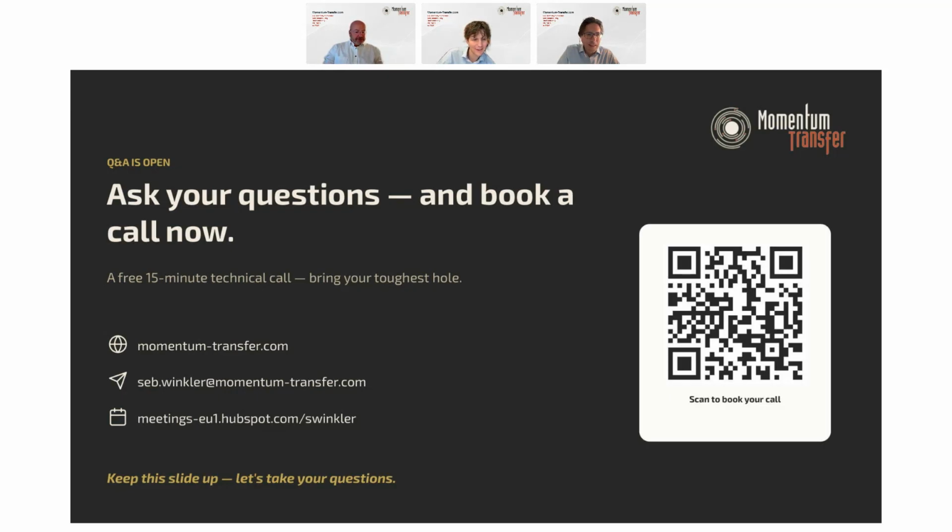Here, Pardeep is asking a question. What's the difference between normal XRPD and synchrotron XRD? Maybe Ben, you can summarize. Yes, I'll do my best, Pradeep.